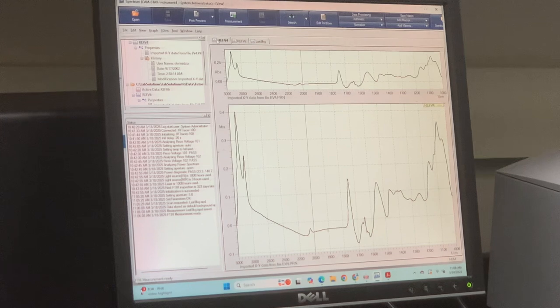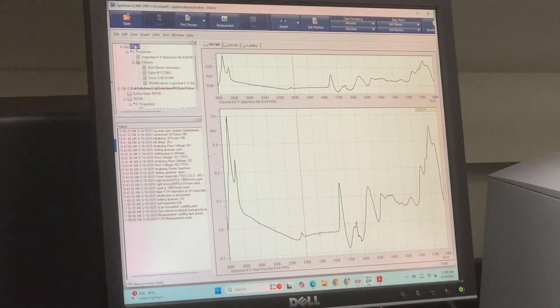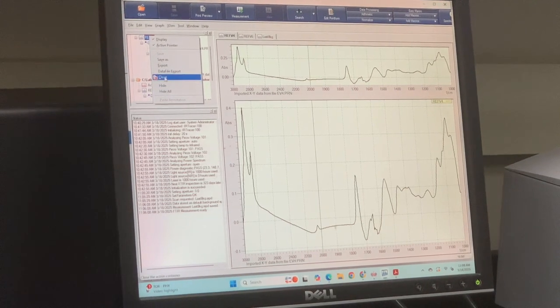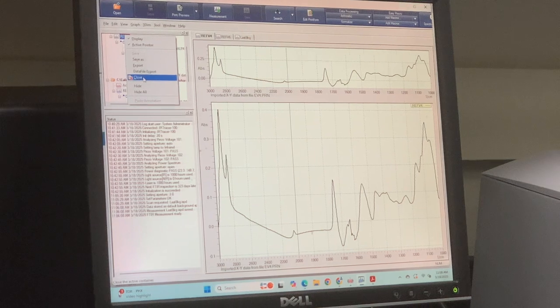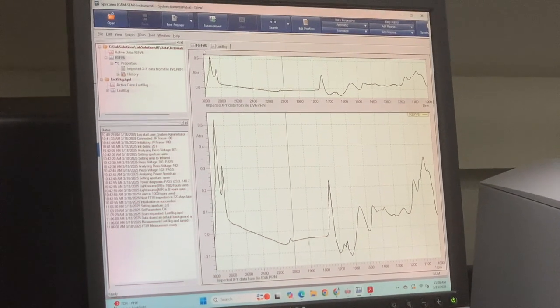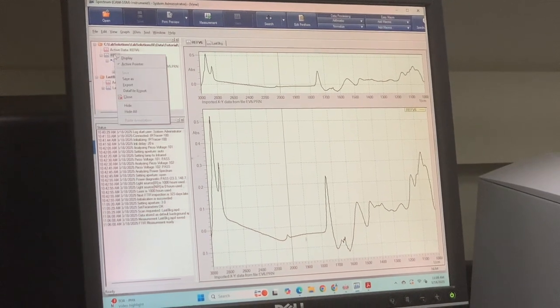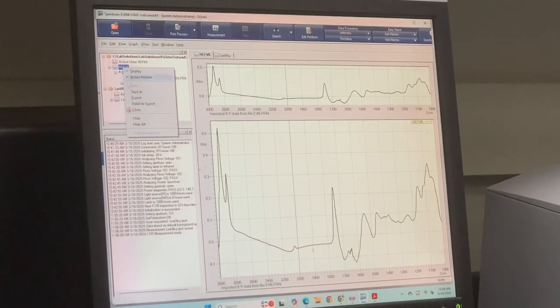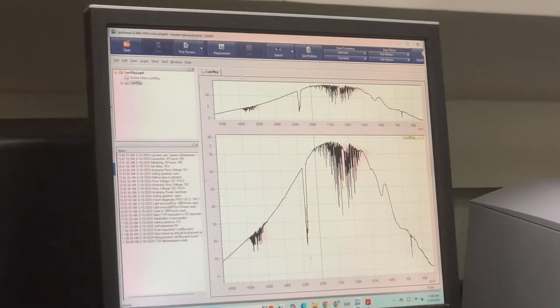Sorry, I'm going to close these. These are just random files. So if you're done using a file, right click, close, and then see how that tab is now gone here. Click close. So now our background is all we have.